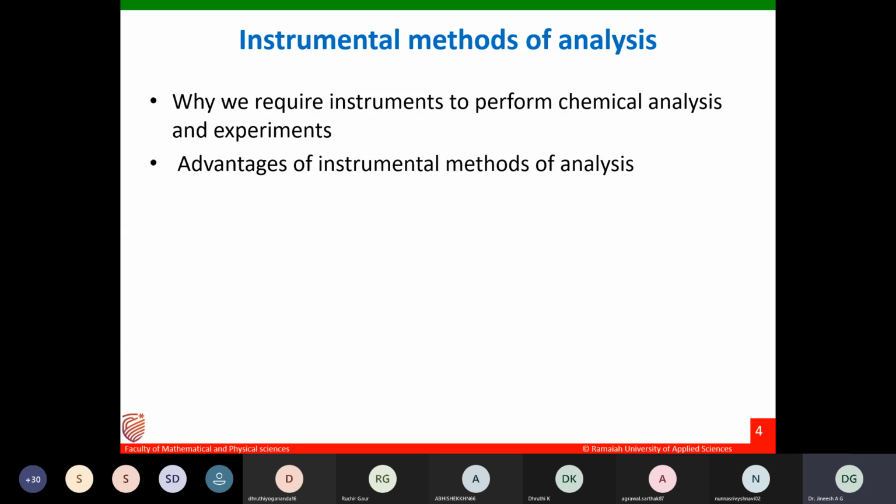If you are doing only 4 experiments per day and the company is paying you a very good amount, the company cannot use that, and you will also get bored. You think, I am just doing only 3 titrations per day, I'm not doing any productive things. So the issues associated with conventional wet analysis are time and effort.